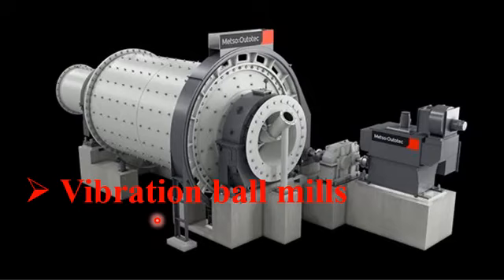Please note that a ball mill works by using balls to grind the material. Materials such as iron or ceramics are added to the ball mill. Next, the ball mill is activated so it rotates either vertically or horizontally. As it rotates, the balls bounce around while striking the enclosed material.